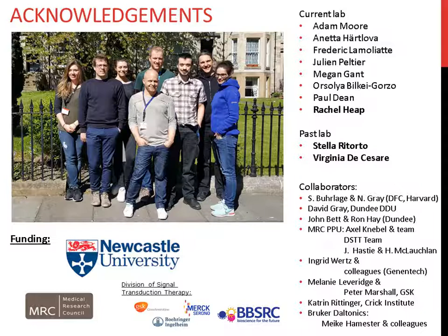Thank you. The next question is, do you find any differential ionization efficiency between the substrate and the phospho product? Yes, we do. This is well known in MALDI, that there is a difference in ionization between substrate and phosphopeptides. But in this case, it didn't make much of a difference because, if you wanted to do absolute numbers, then you would need to have isotopically labeled substrate and product in there. But because you're only measuring how much you can phosphorylate compared to your substrate, it didn't really make much of a difference in our hands.